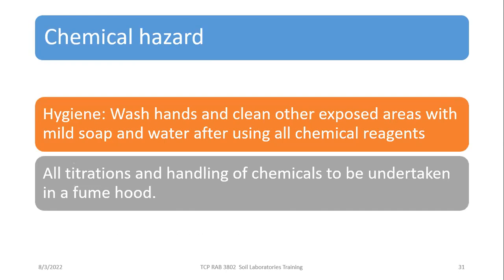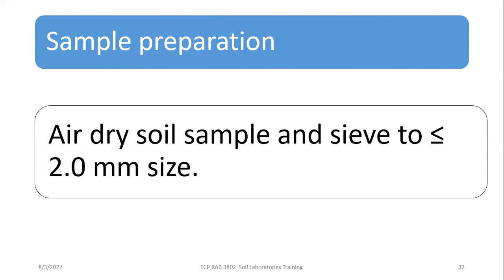Regarding hygiene, there is a need for washing hands and cleaning other exposed areas with mild soap and water after using all chemical reagents. All titration and handling of chemicals is to be undertaken in a fume hood.